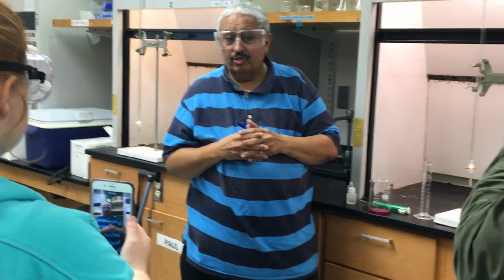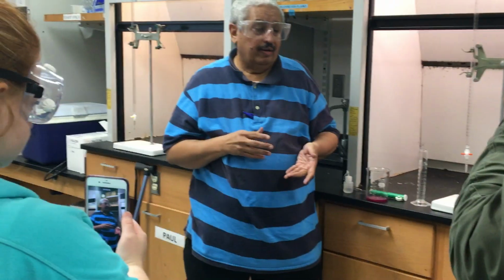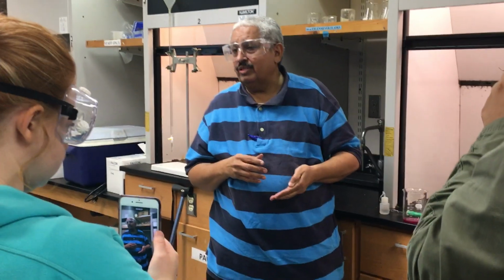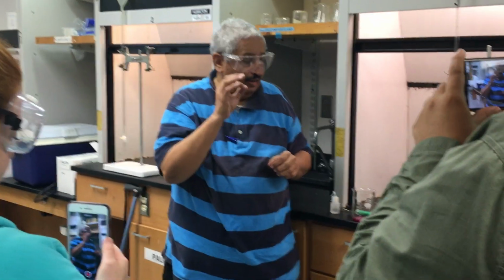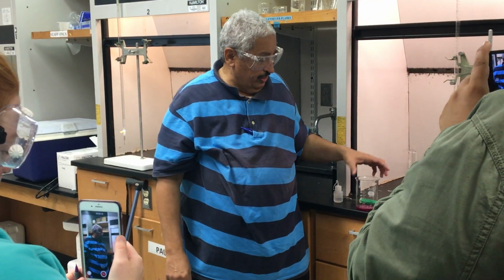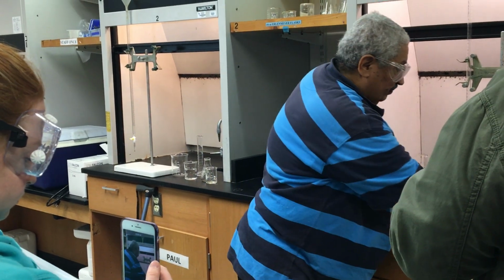Correct? So the burette is followed by the volumetric flask, followed by pipettes, and then the graduated cylinder, and the beaker is the worst glassware because it's not really very fine calibration, correct? Very crude calibration. So now it's conditioned. I will add to this here.